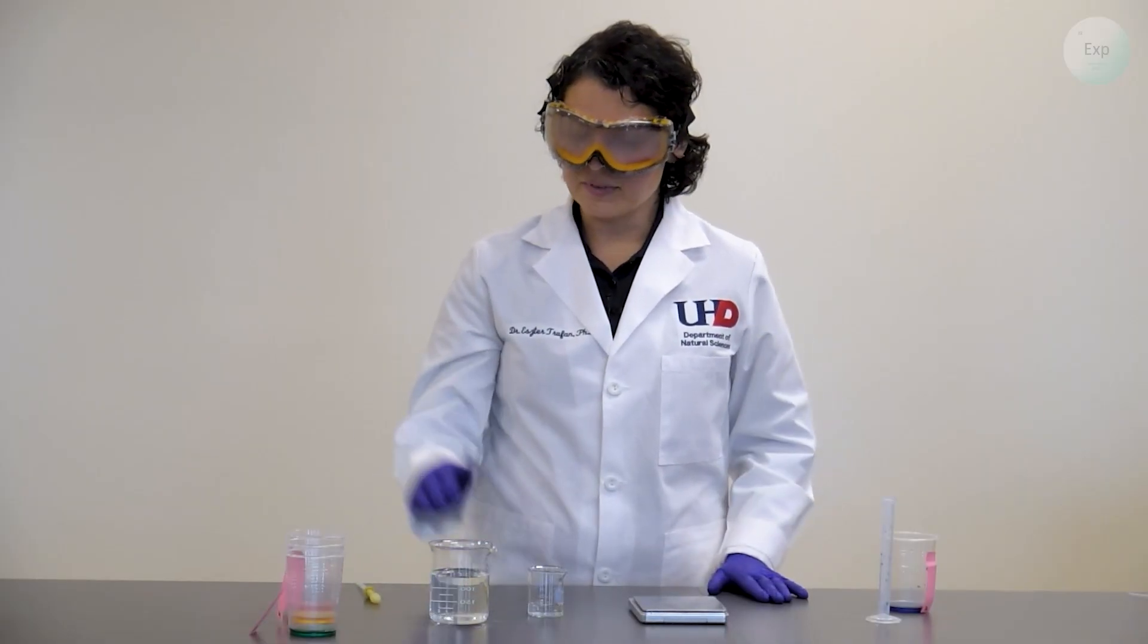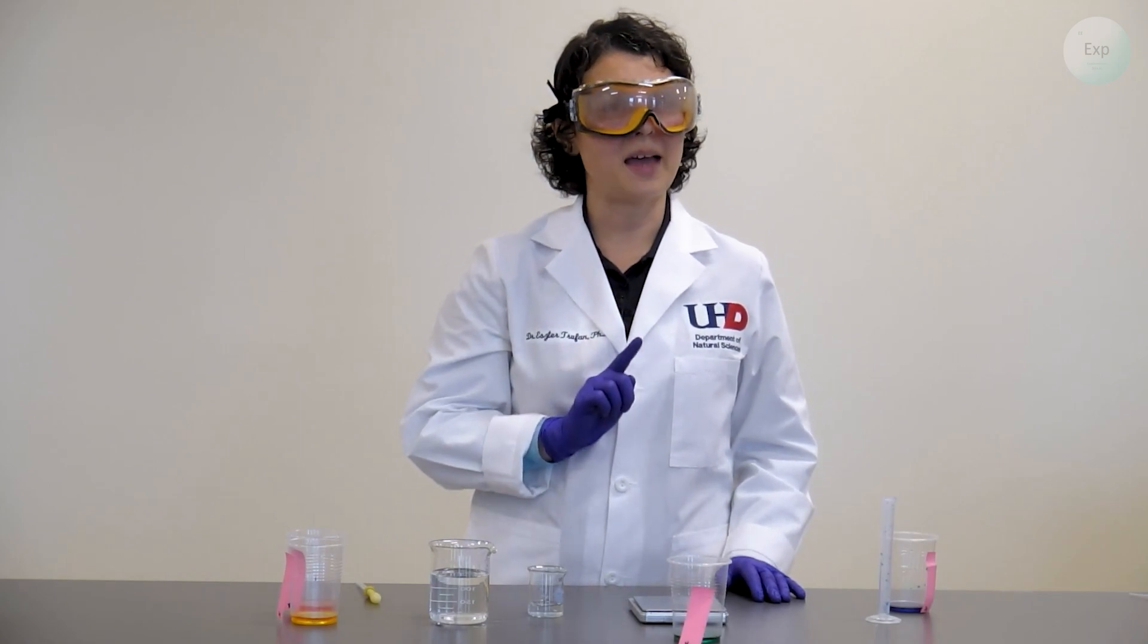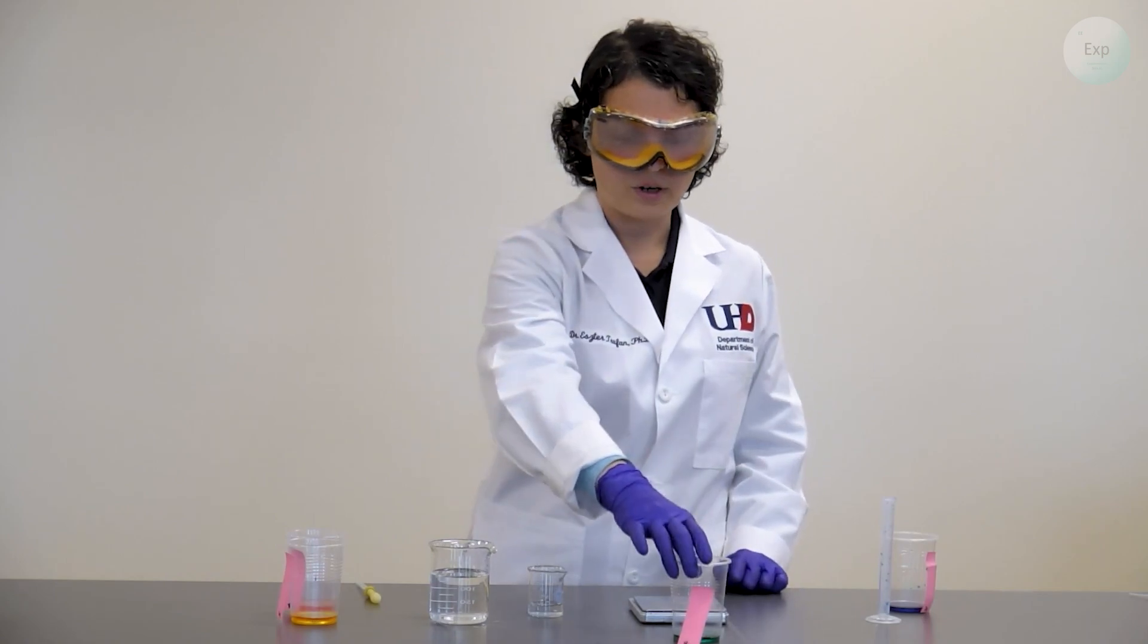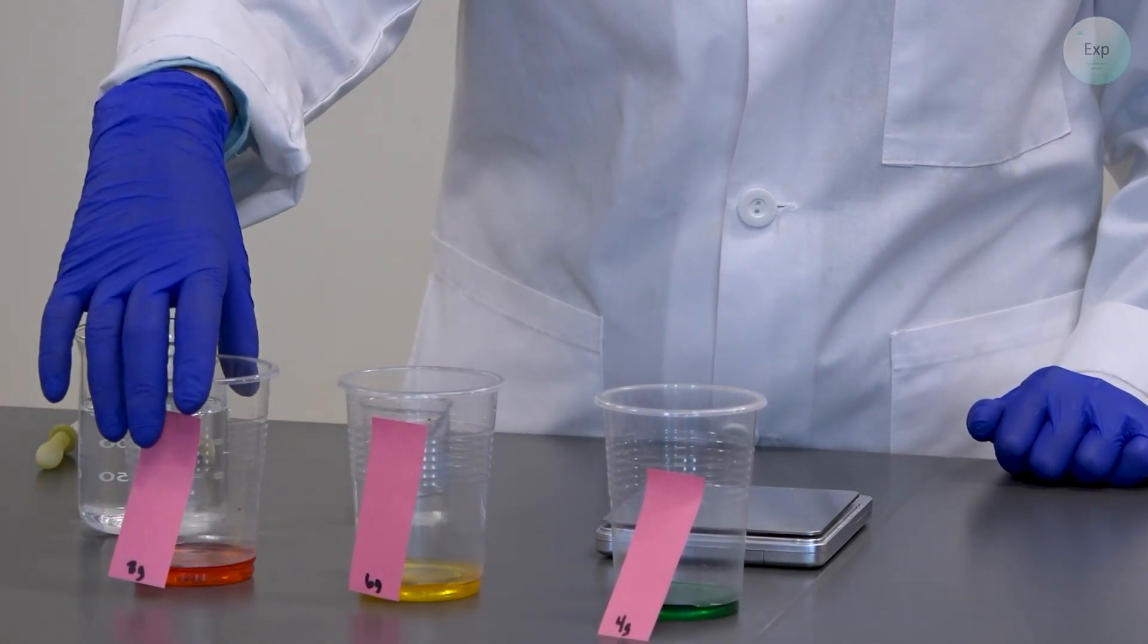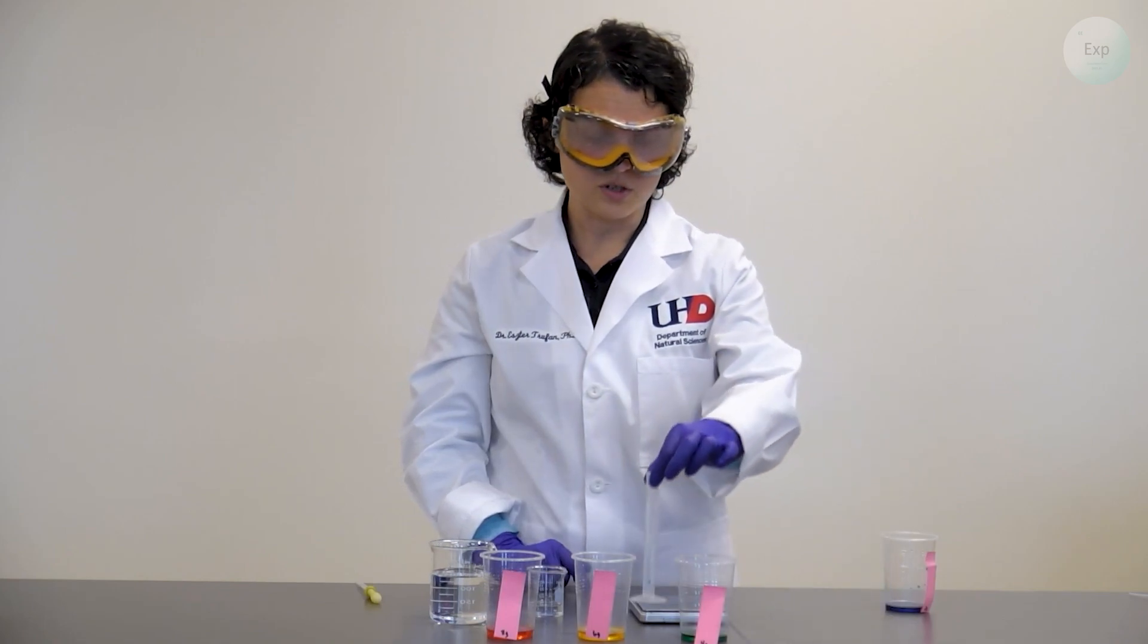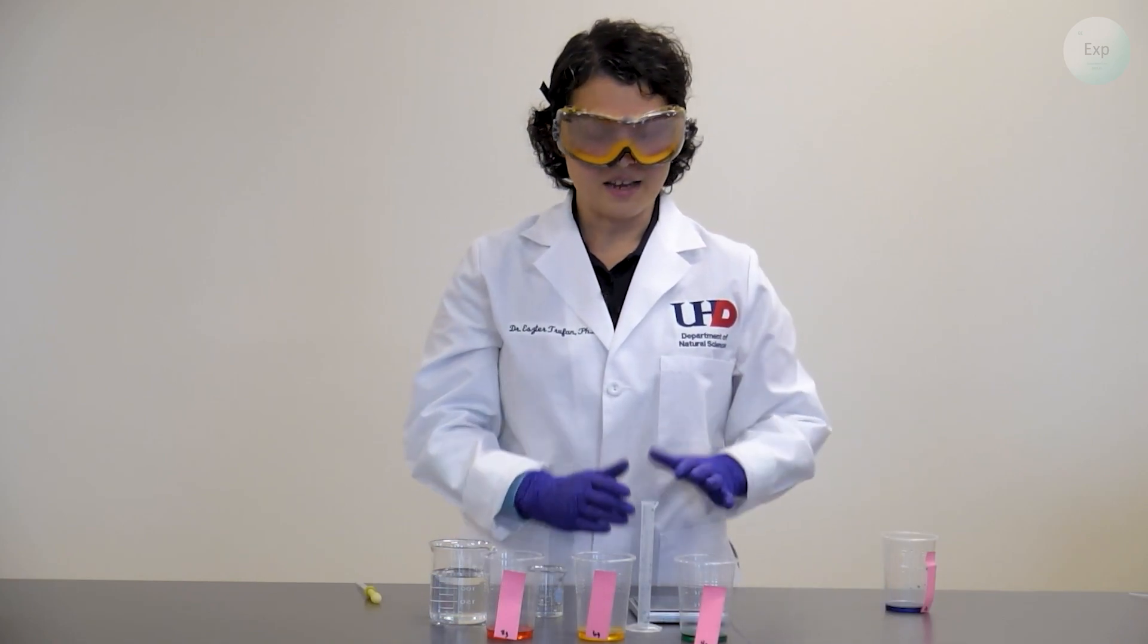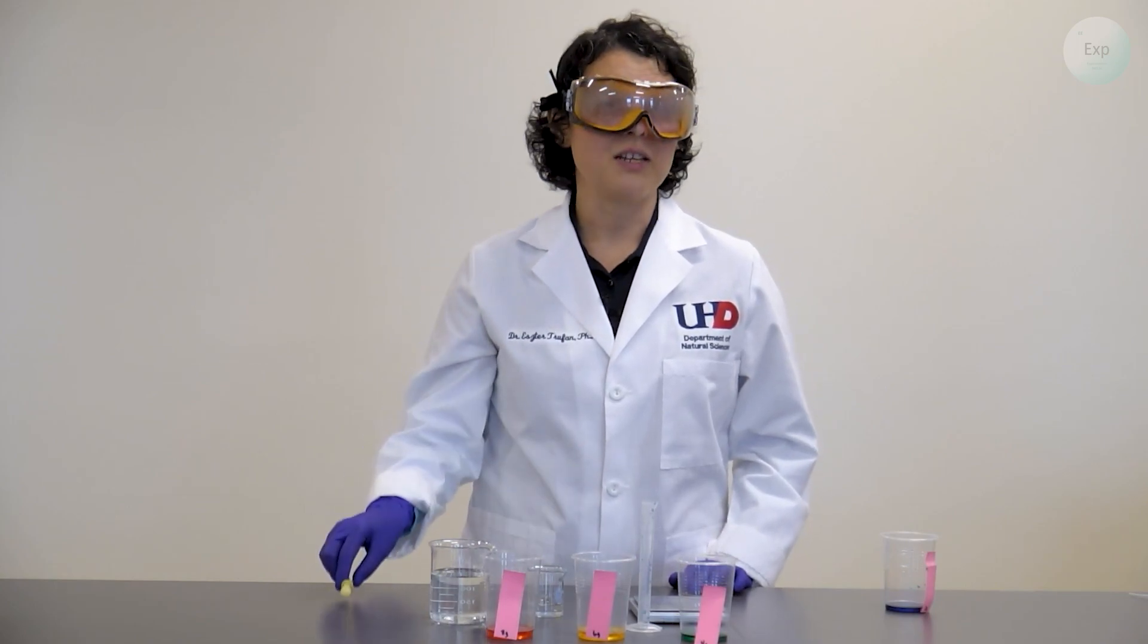For the next part, you will do the same type of three recorded measurements for mass and volume for your green solution, your yellow solution and the red one. Keeping in mind that in between measurements, in between solutions, you will need to rinse and completely dry your graduated cylinder and thoroughly rinse your pipette.